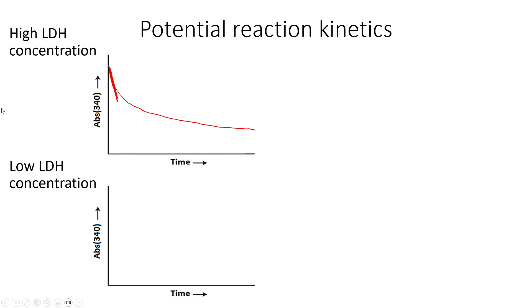If you have a fairly low LDH concentration, you might see a graph with a similar shape, but the computer software will automatically zoom in, so you'll see what looks like noise. You'll still see the same reaction shape, just with more noisiness to that gentle slope. As long as you have a gentle slope and something you can measure as that initial velocity, that is perfectly sufficient.